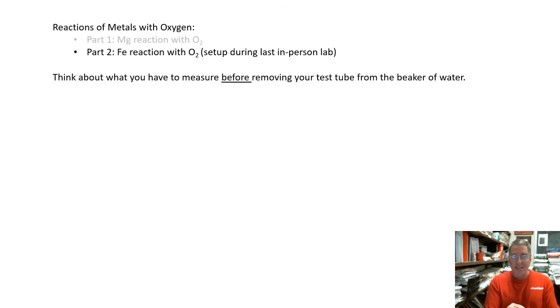We have rubber bands to mark on the test tube. And anyway, let me know if you have any questions. If you need any help with any of the calculations or getting your lab report done, please post those to the discussion page on D2L.